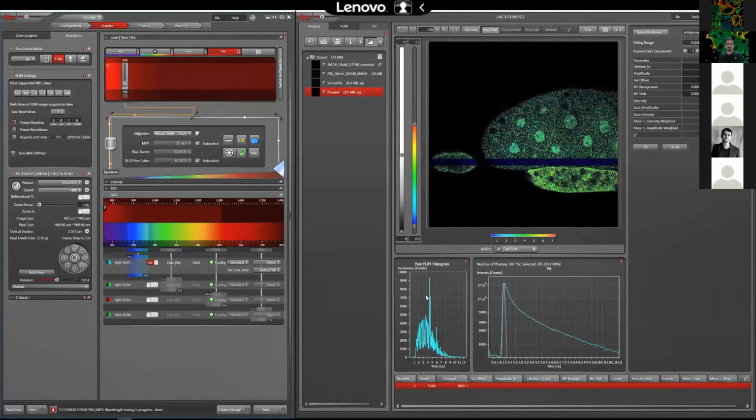There is a sample, so I need to locate the proper field of view. I need to decide what is the proper field of view, what I'm going to see. So the ROI, that is important. And also what is the resolution I need, what is the speed. So that's the compromise I told you. Usually in microscopy we have speed, then we have the field of view, and that one is actually correlated with the resolution you need, and also how long it takes. And also if you want to do 2D, 3D, and so on.